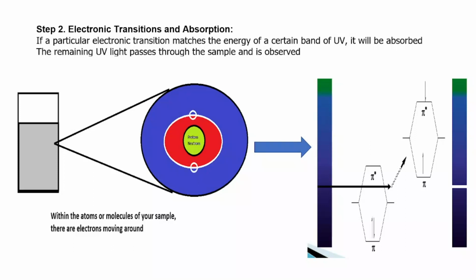But before that, let's take note of this. We know that in science, matter is made up of what? Microscopic components that we can call atoms. So when you move right into the microscopic level of your sample, let's say the sugar solution in our scenario here, you would realize that we have atoms in there, and these atoms have electrons that are revolving around them constantly.